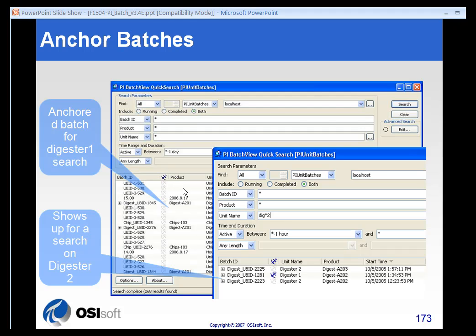One of the nice things about the batch quick search function is that you can anchor batches. There's a column here for anchoring batches. This will anchor that result, and any future searches will include that result even if it doesn't fall into the criteria. So if you have a golden batch or a batch you're comparing other things to, you can anchor it and continue to do other searches and that batch will appear in your future searches. In the example, we've got a batch from unit one, but we anchored that and then searched for unit two and brought up more results, but the unit one still appeared in the search.